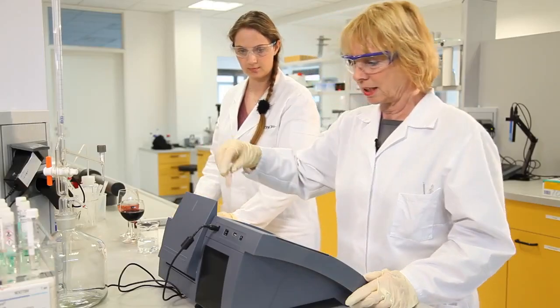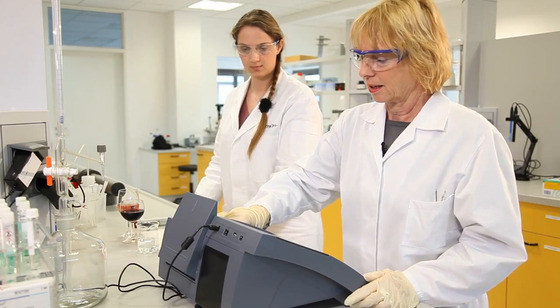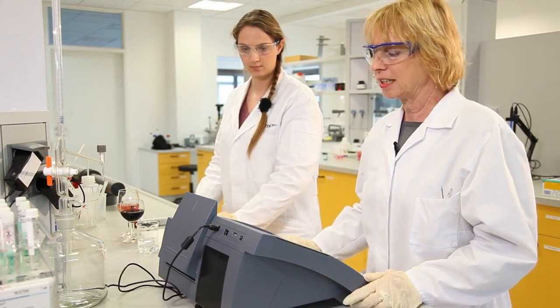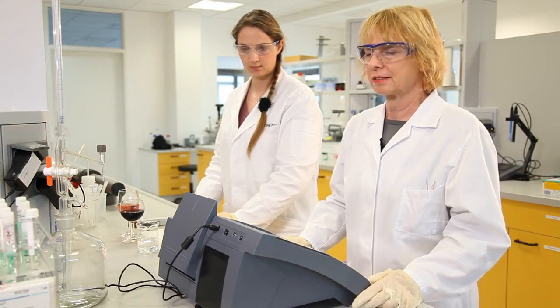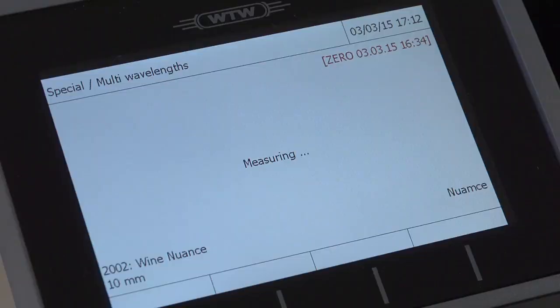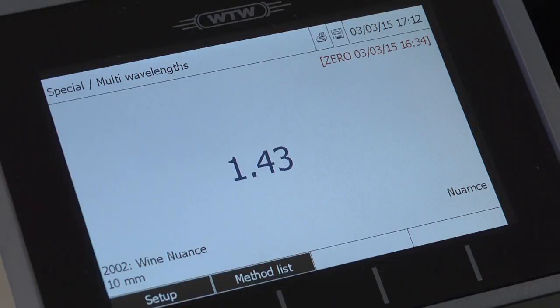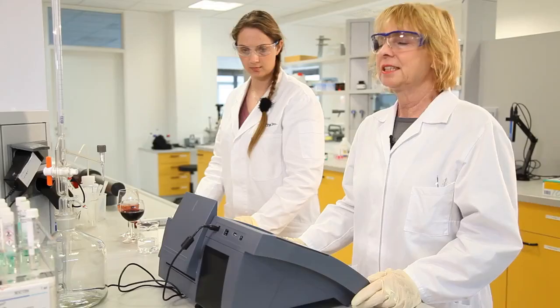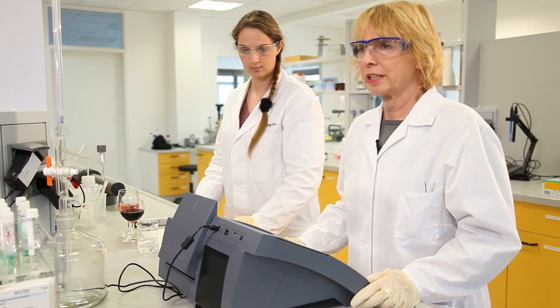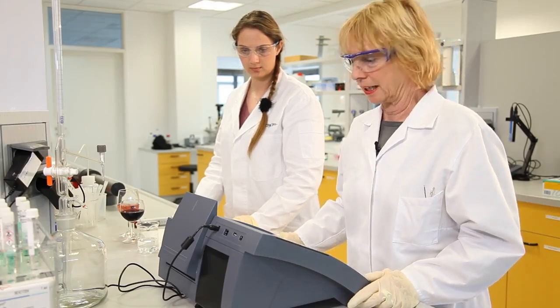Now we measure the rosé. The ratio once again is between 420 and 520 nanometers and we get a reading of 1.43. This color nuance means that it falls in the yellow-orange range.